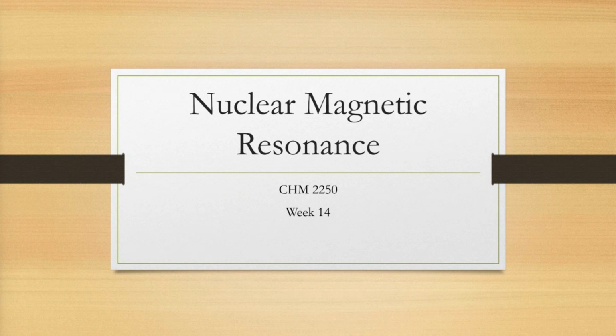This week we're focused on nuclear magnetic resonance, or NMR. This is a very widely used analytic tool to analyze samples. It's used in industry, and you'll be using it a lot in Orgo 2 lab. So we'll get a preview of it this week in lab.